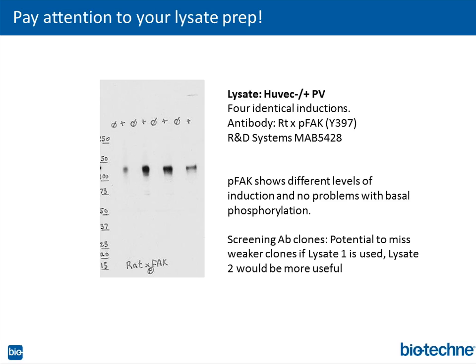If you were to use lysate from lane 1, you might underestimate the power and the reactivity of that clone versus lysate 2, which shows a much stronger signal, and you might miss some clones that could have had great affinity and great avidity. So you want to make sure your lysates are prepped properly and you pay attention to all the small details here.